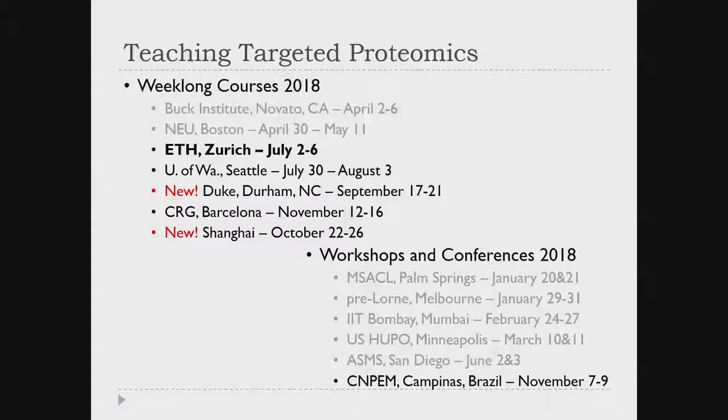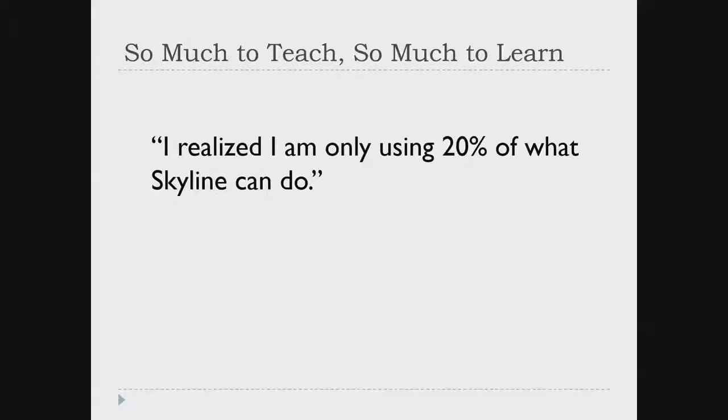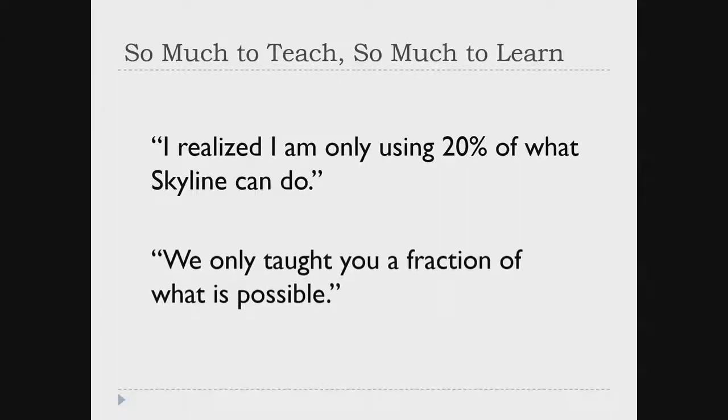And I'm actually sending out a group to Brazil that Tina's part of, and I'm not even going to go. One of my favorite quotes from a course in Brazil was somebody said, after the week-long course, "I realized I'm only using 20% of what Skyline can do," and my response was, "We only taught you a fraction of what is possible, so maybe you're still only using 5%."